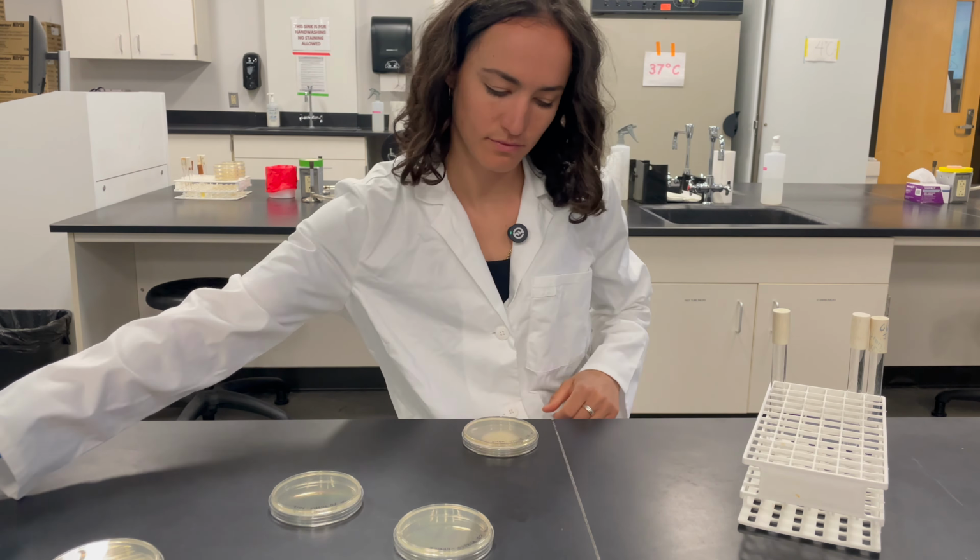Colony morphology includes shape, like circular or irregular pattern. It could refer to texture, like smooth, rough, or wrinkled. For example, a lot of the growth on our soil plate is really wrinkly in texture. And it can even refer to color. Some of these are yellow and some of these are white. So these characteristics really help us in figuring out what microbial species might be on this plate even before we bust out a microscope or do any physiological tests.